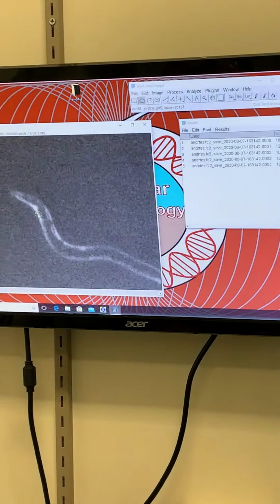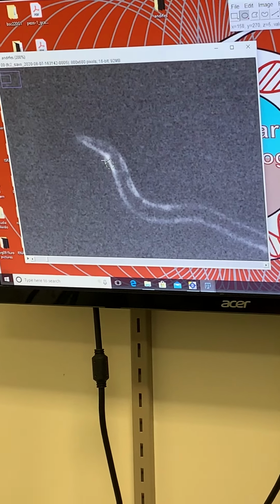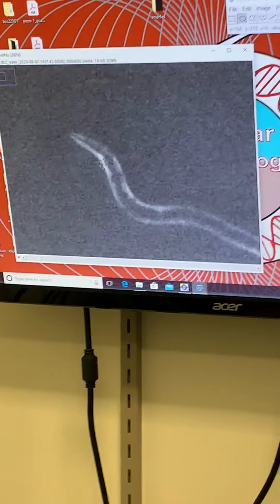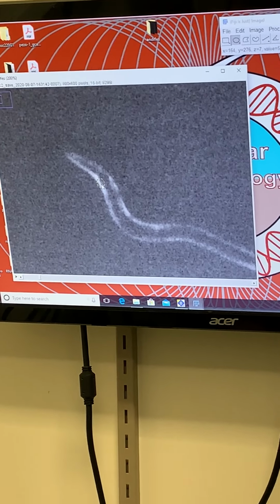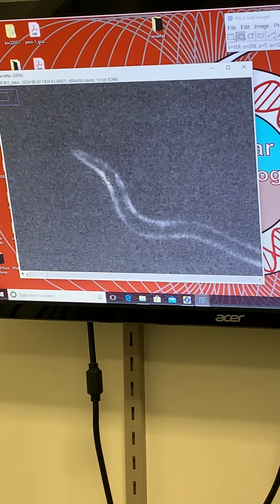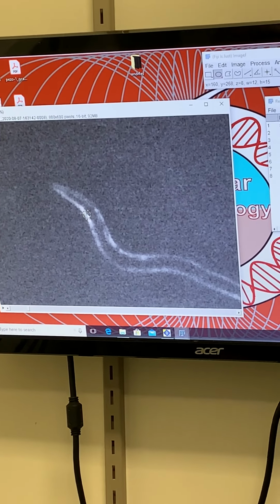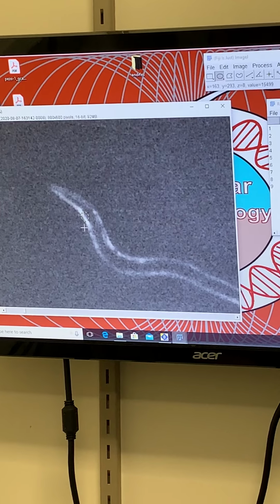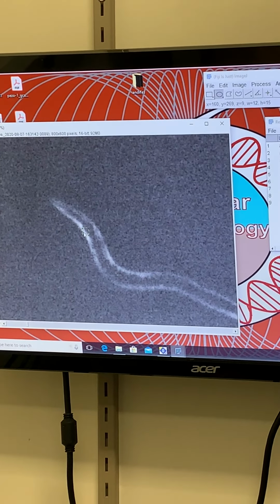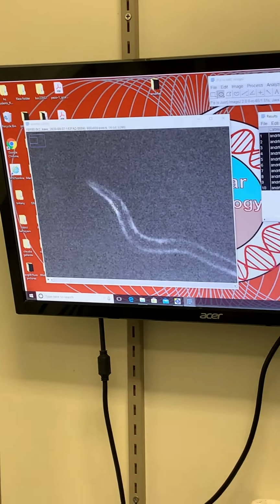You're advancing, making sure that you are on the side. As the worm keeps moving, you're going to have to reposition that circle to still measure the same muscle, okay? Which is the reason why we're going with the pharynx, because it provides a very obvious landmark when you're recording this, okay? So you can see the numbers kind of dropping here.